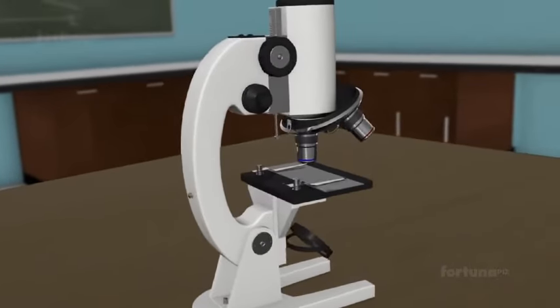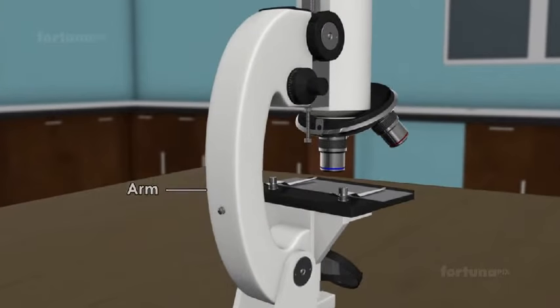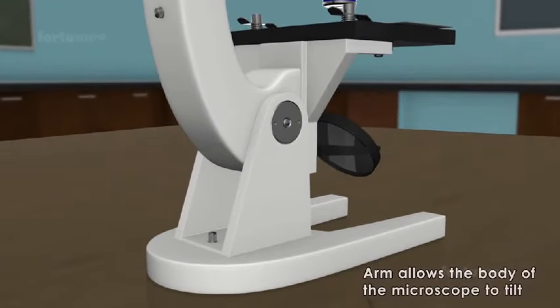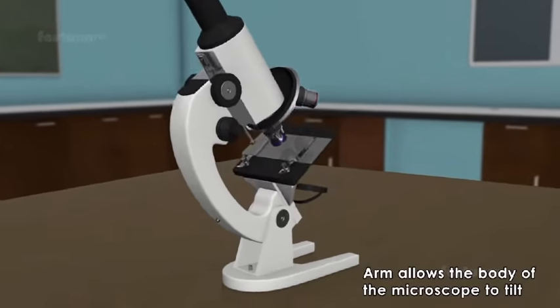The body tube is arranged on an arm which is connected to a strong base. This arm allows the body of the microscope to tilt.